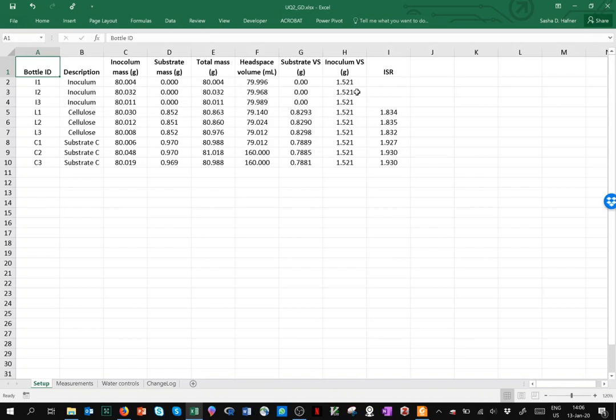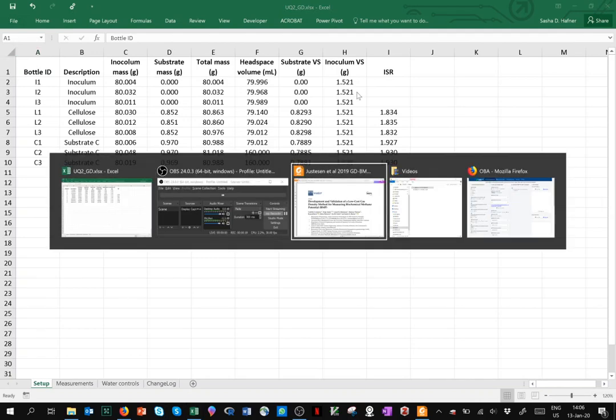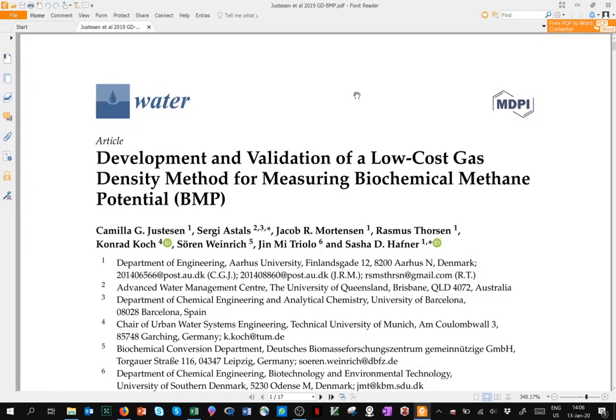In this video, I'll give a demonstration of how to use OBA, the online biogas app, to calculate BMP, biochemical methane potential, from data that were measured using the gas density method, or the GDBMP method. This method is described in quite a bit of detail in this open access paper.